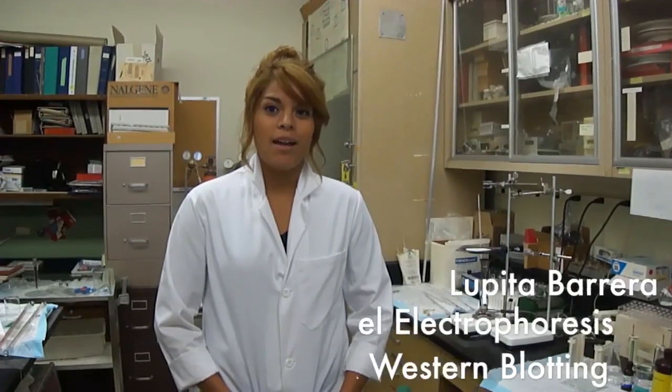Hello, my name is Lupita Barrera, and today we will be exploring gel electrophoresis and Western blotting. These are analytical techniques that are used to detect specific proteins in a given sample of tissue. Electrophoresis determines the presence and/or relative abundance of a given protein, and Western blotting is a method used to quantify the amount of a protein.